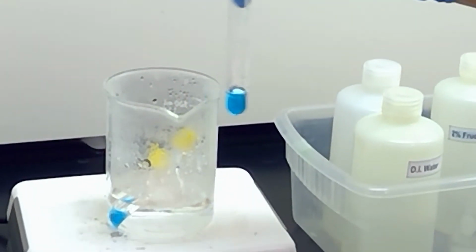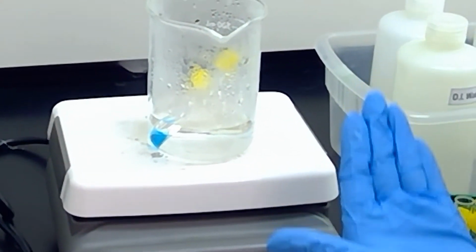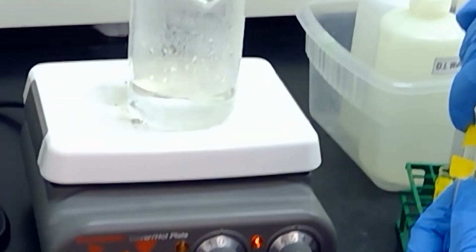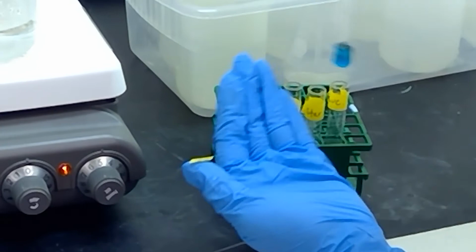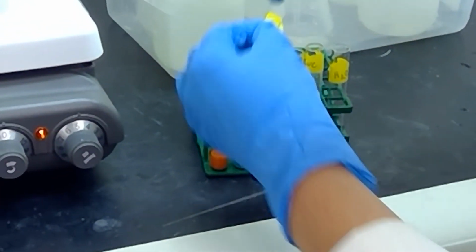This is sucrose. So sucrose is nice and dark blue. Sucrose is a non-reducing sugar. And lastly, we have our blank, which is DI water, to show us what should happen when that Benedict's reagent is heated. So let's pull all of these up so that you guys can see them all together.